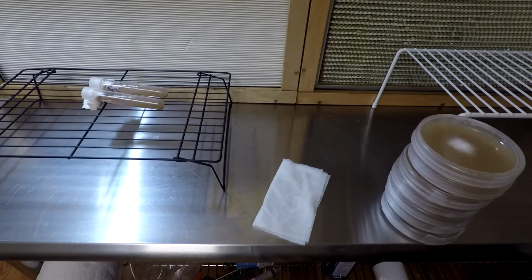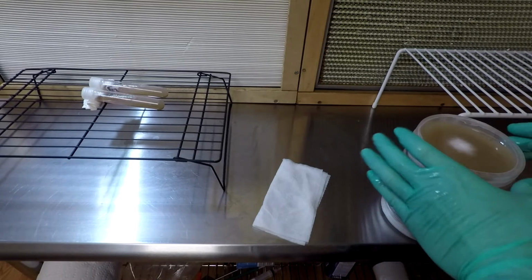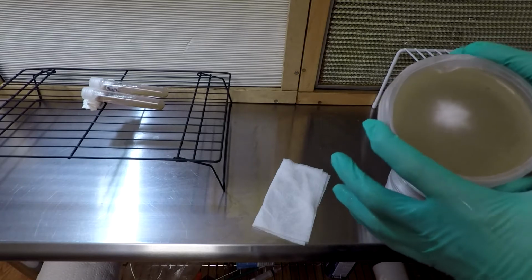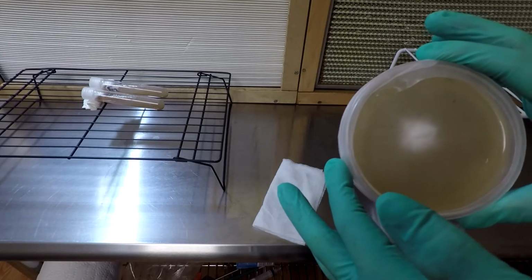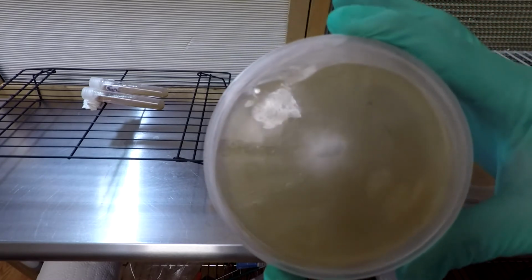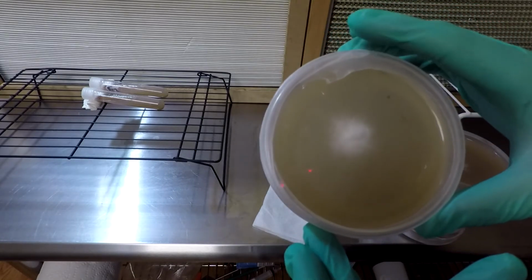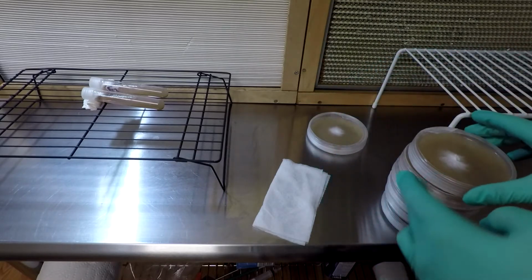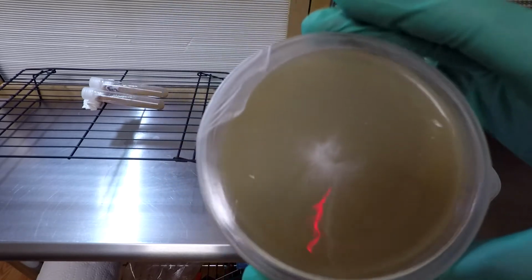But it is interesting to see the variation and the different styles of how these semi-isolates, I guess you'd call them, because each one is from a different area of the dish. It contains a different set of strains within the king oyster complex. You can see this one's pretty cottony and thick. It's actually the one I'm going to use to put on my slants. This one's about as thick, but not as cottony, about the same distance of growth.